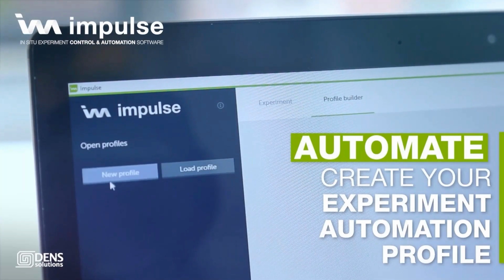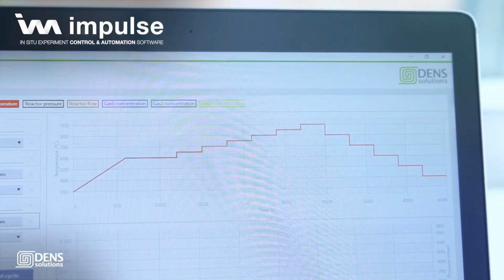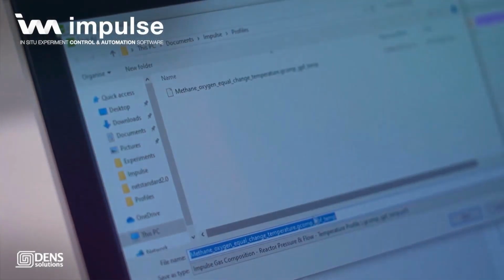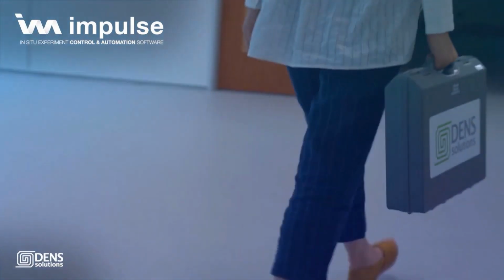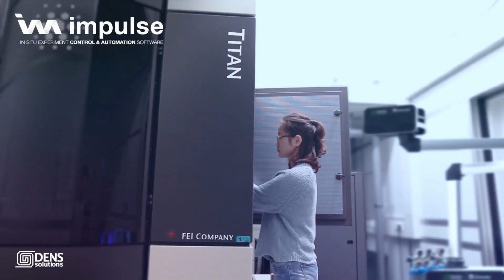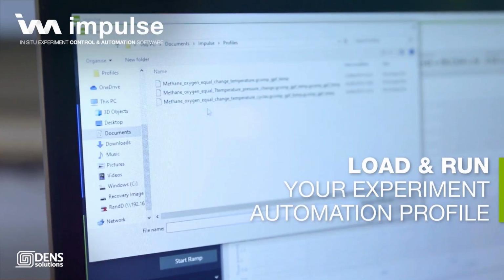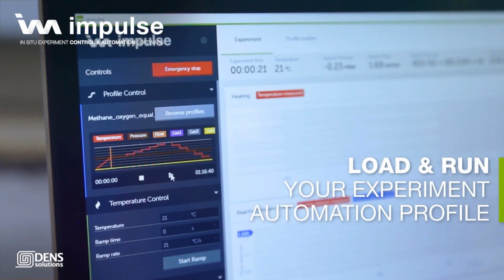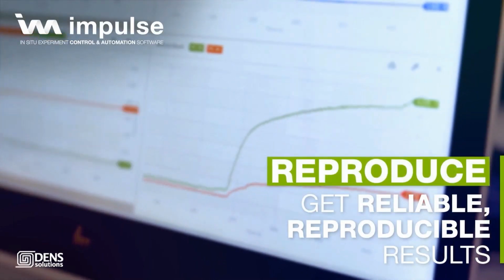After you find the proper condition, you can build up the profile with the parameters you want. After the creation of the profile, you can load the profile on the benchtop and test if it is reproducible or not. After that, we bring the system to the TEM. Now we don't need to go through the optimization process. We just load the optimized profile from the computer and click run. Now we leave everything from the DENSsolutions Climate system to the computer.